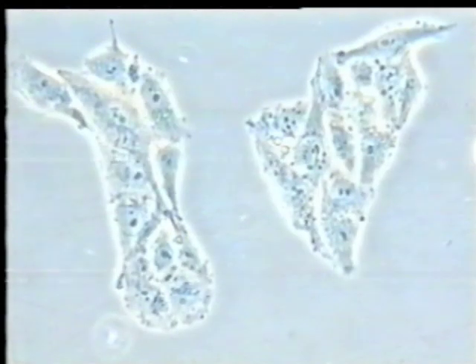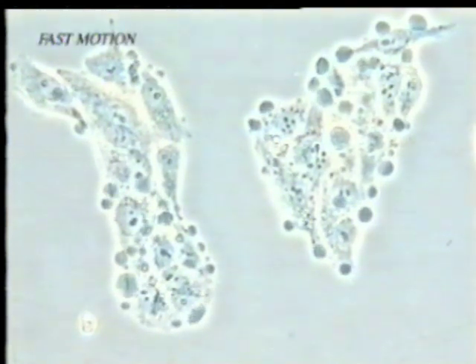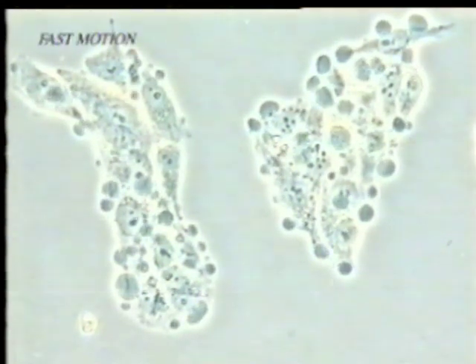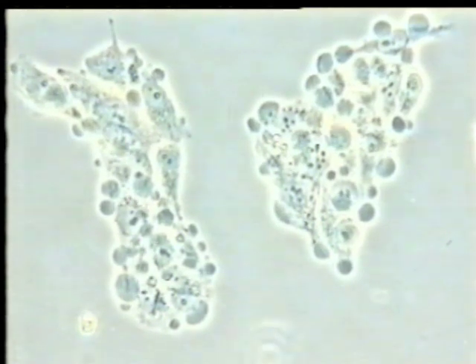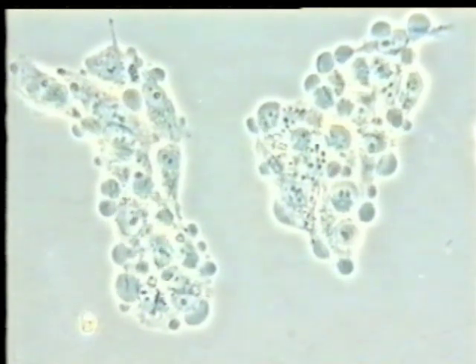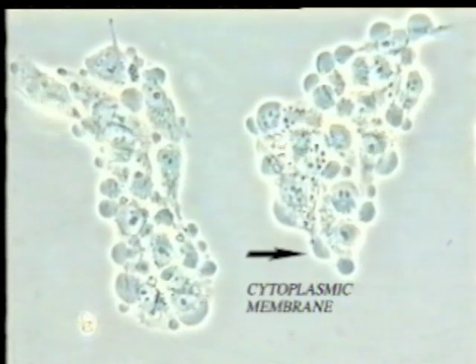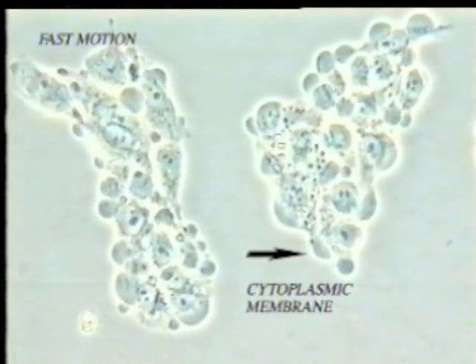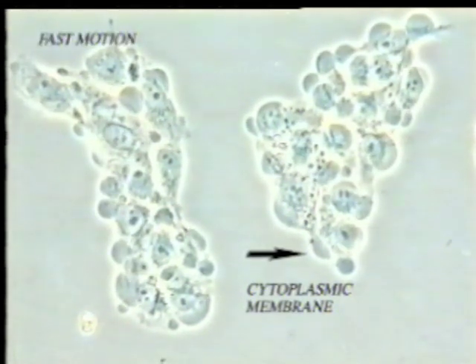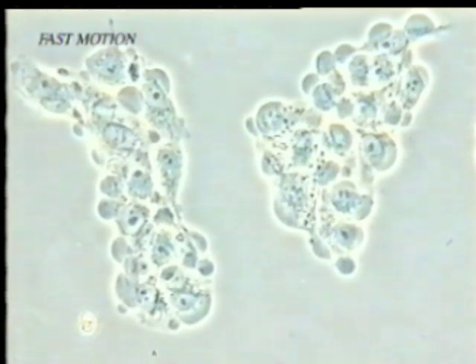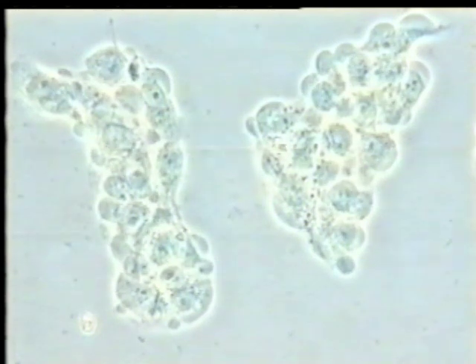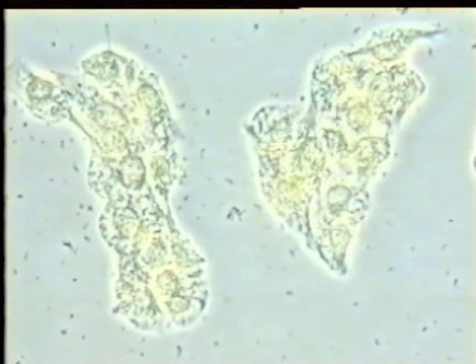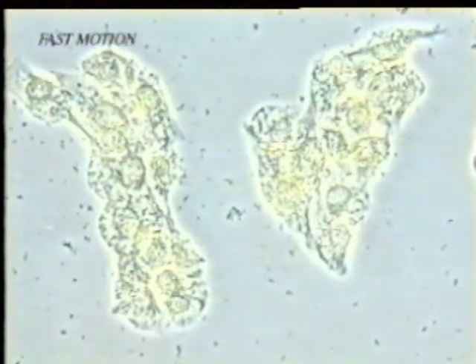We shall now add PB100 at a concentration of one milligram per milliliter to a glioblastoma cell culture. Changes observed using normal low doses occur more rapidly and become more striking using this very high dose. Morphological changes occur in cells within minutes. Blisters appear along the cytoplasmic membrane and the cytoplasm swells. Under visible light, the characteristic yellow color of PB100 may be seen traveling across the cytoplasm, which becomes less homogenous.